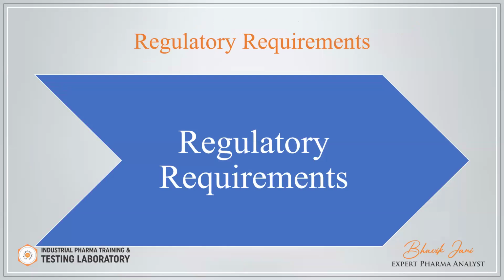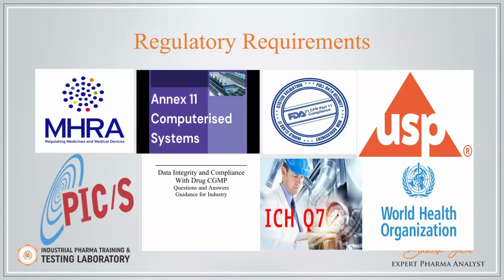So we are going to start the training session with the regulatory requirements. What are the regulatory requirements for the audit trail review? We will discuss the MHRA, Annex 11, 21 CFR Part 11, USP, PIC/S, Data Integrity and Compliance guideline, ICH Q7, and WHO.